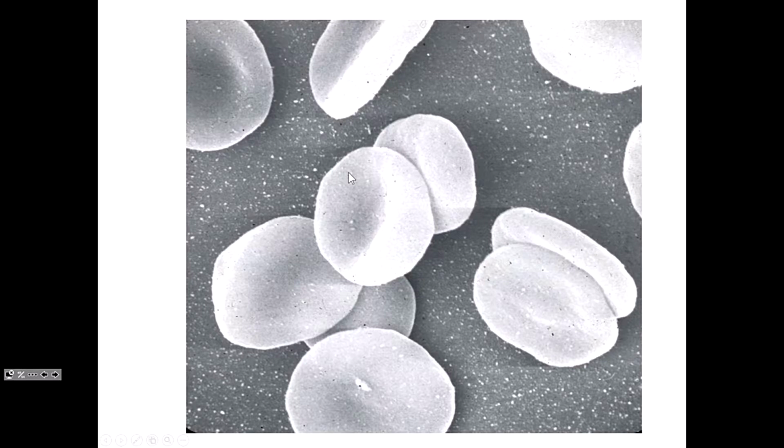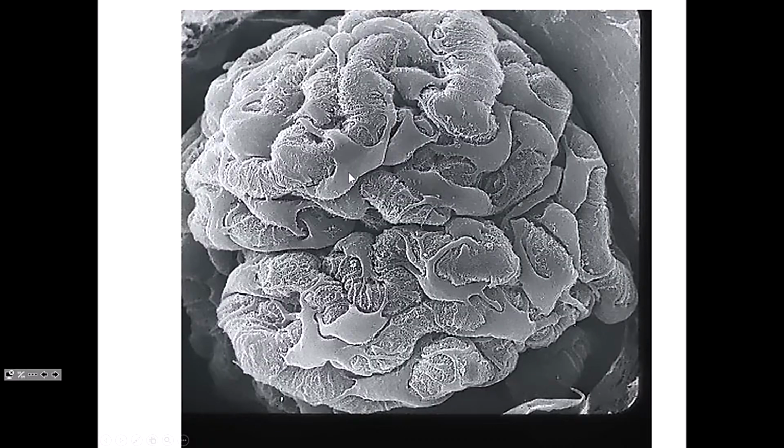So we can see the surface of a red blood cell. Okay? Surface of a red blood cell. We're not looking inside, we're looking at the surface of the cells. So here we can see the surface topography of the glomerulus of the kidney, which we will discuss. I think that's actually the very last lecture of the course.